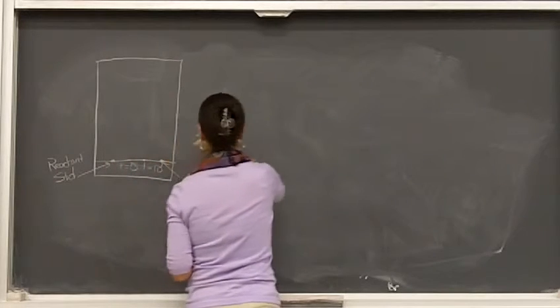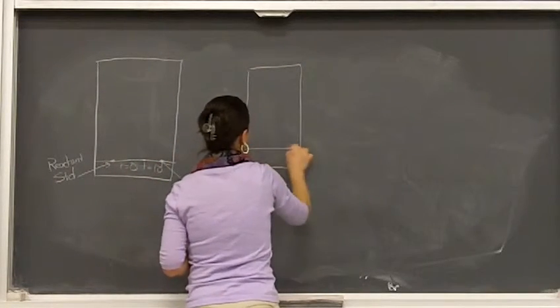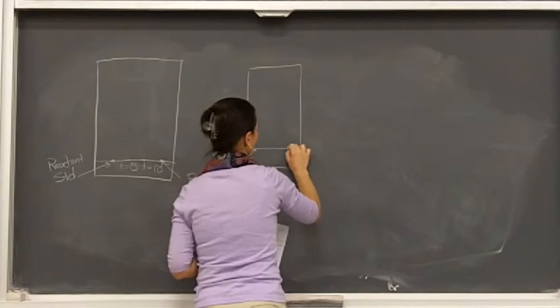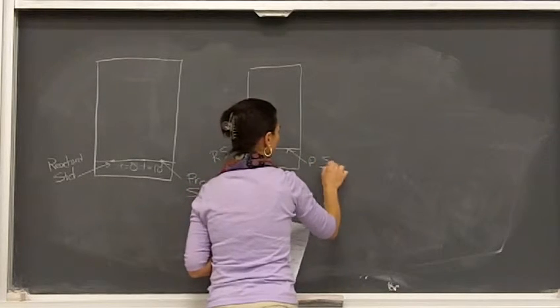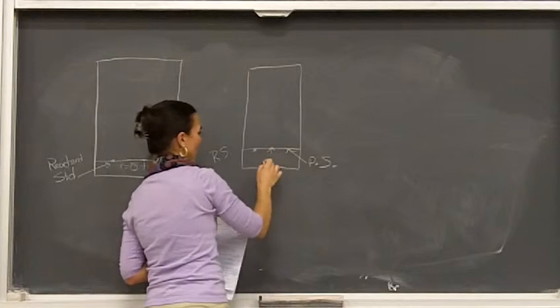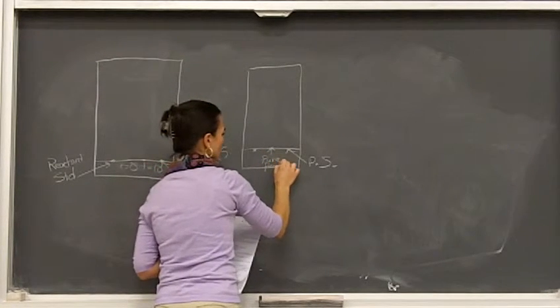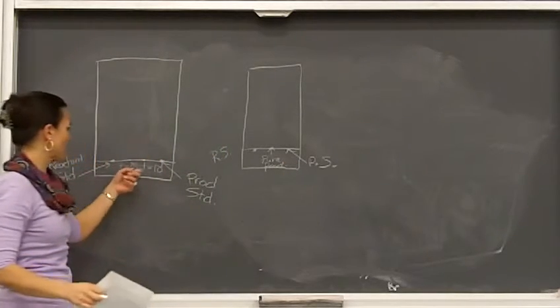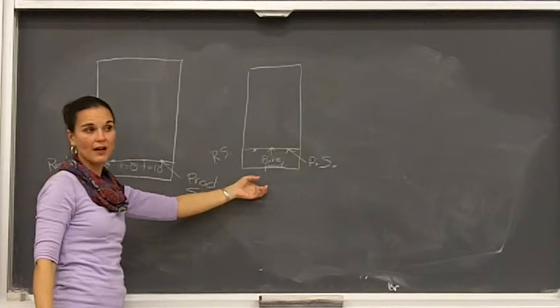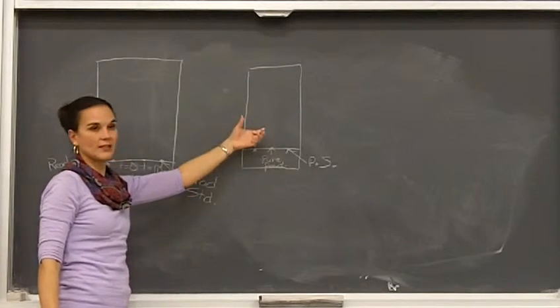And you may be able to get that in one TLC plate, or it may take multiple TLC plates. Then we'll have our reactant standard, our product standard, and at the very least, you also want to have where you spot your pure product. Okay? So at the very least, you want time 0, time after 10 minutes, and then when you've purified and recrystallized your product, you want to spot that on a TLC plate and run it with the standards.